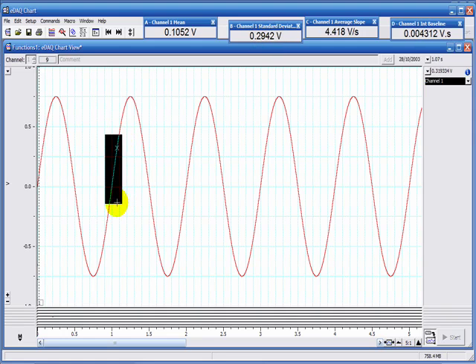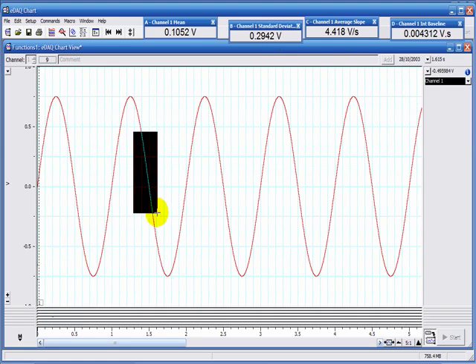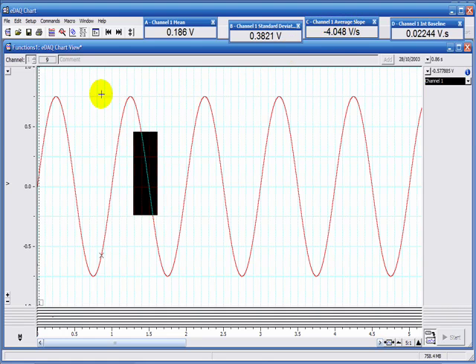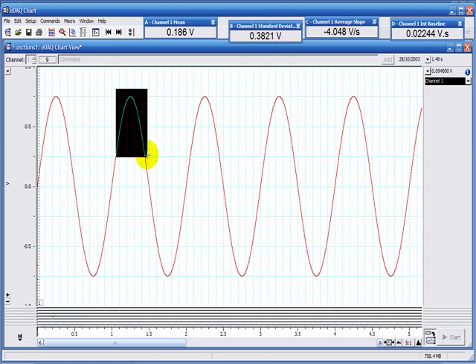If I choose this box, here my data has a positive average slope. If I choose this area, it has a negative average slope. If I choose this box, here it's calculated the integral above the baseline.